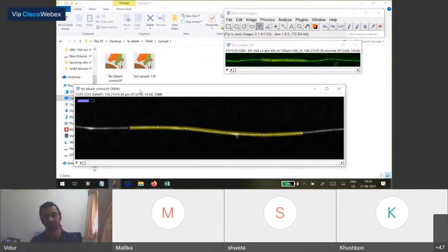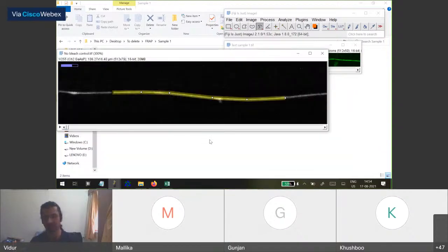Hi Vidur. So I am getting a .rar file. I'm not getting a zip file. That .rar is zip. If you have WinRAR, what you need to do is just right click and unzip it in whatever location you saved.